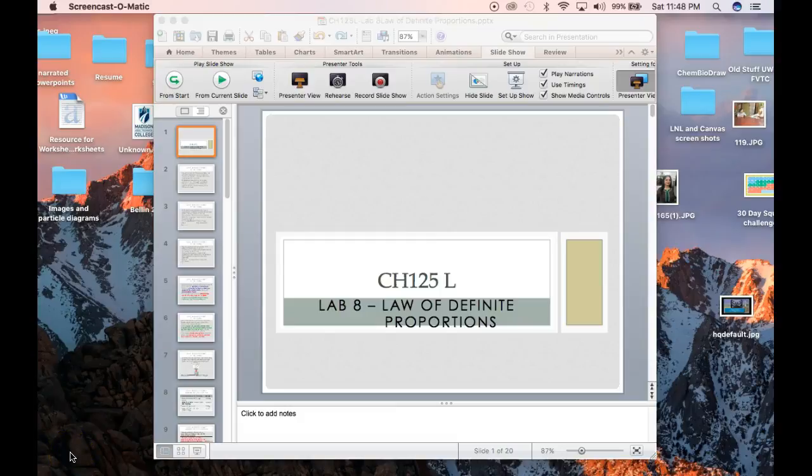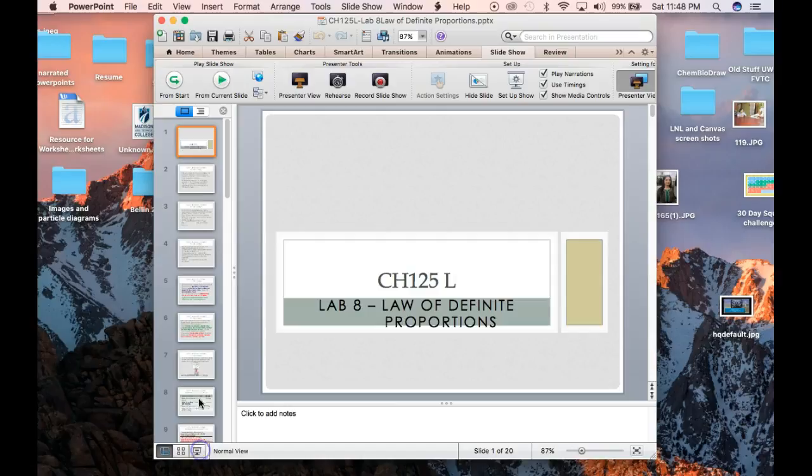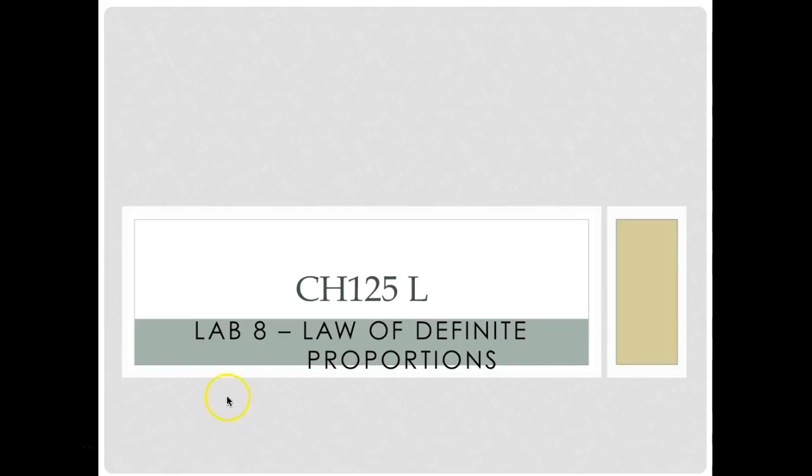In this video, we're going to be discussing Lab 8, Law of Definite Proportion. The Law of Definite Proportion is a lab that deals with the composition of a compound.